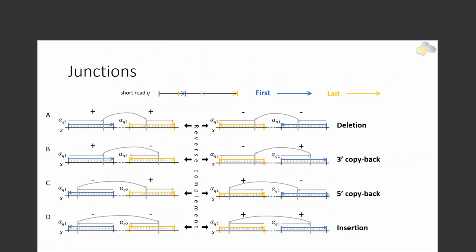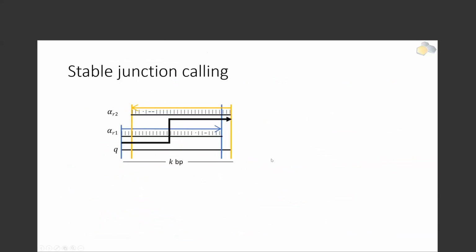So as I was trying to explain here, these are the different cases, but as you can see, in each different case there's a region that is overlapping. There is this overlapping region here between the subsections, and where you draw the line, where you jump here and you go there, that's not a straightforward call. That's something that we have to look into, right? Whether we should jump and call the junction point on this end or this end.